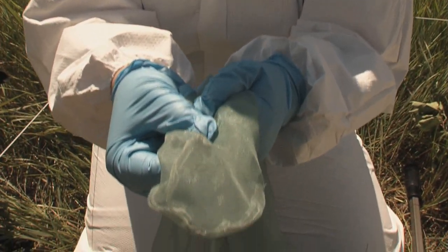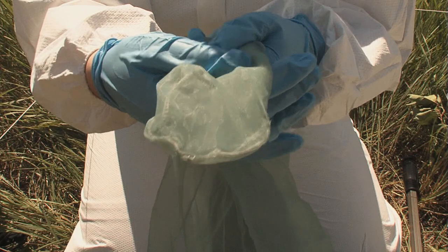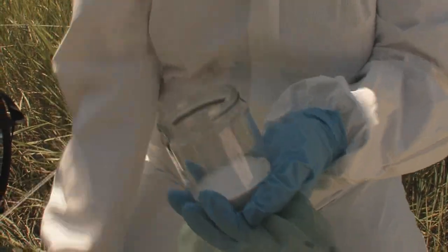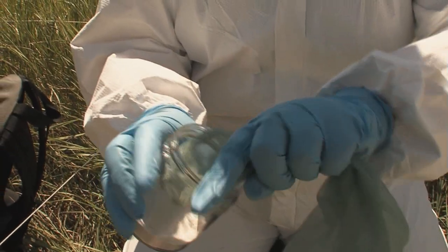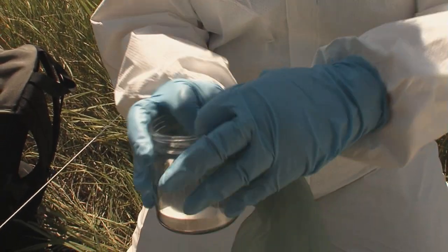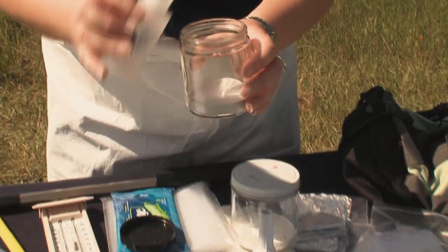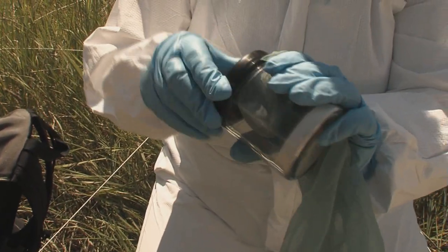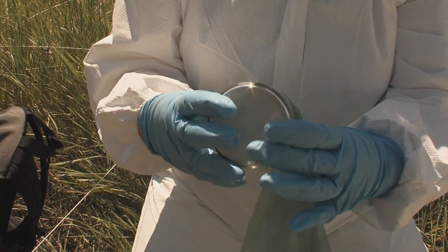For all of the adult flies and beetles, those are all done as dead preserved samples, so you do need a killing jar. These are jars with plaster of Paris in the bottom. The jar is charged initially with ethyl acetate, then keep it closed — you don't want to inhale this, or you will pass out.